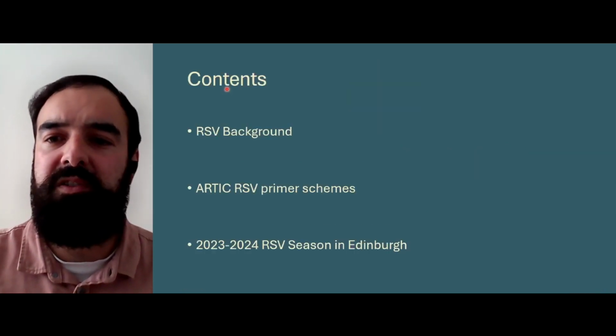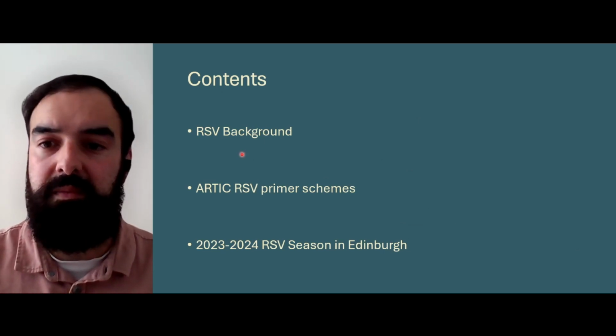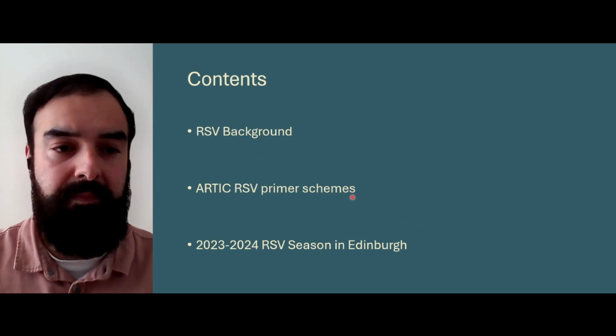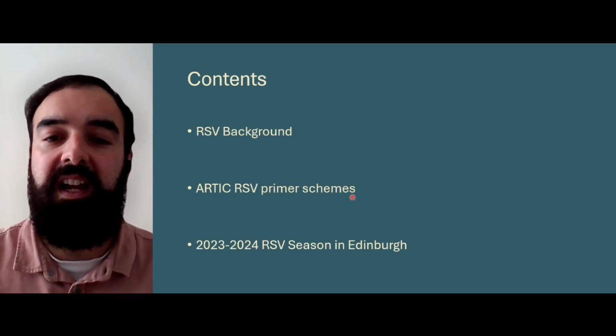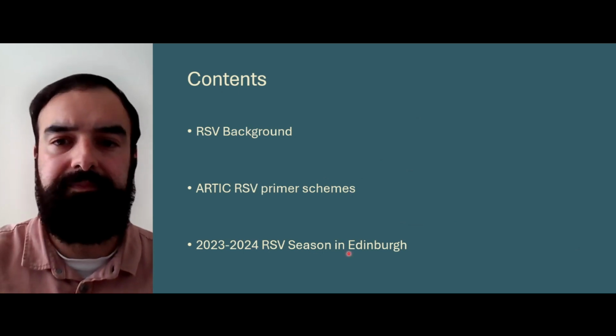So I've broadly broken this talk into three parts. First, I'll give you a quick intro into RSV and why people are so keen to sequence it at the moment. Then I'll talk a bit about our novel primer schemes and how they've been performing so far. And finally, fill you in on our sequencing efforts to catch the 2023-2024 RSV season in Edinburgh.